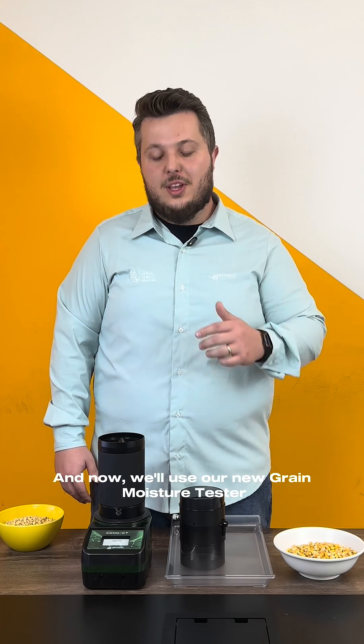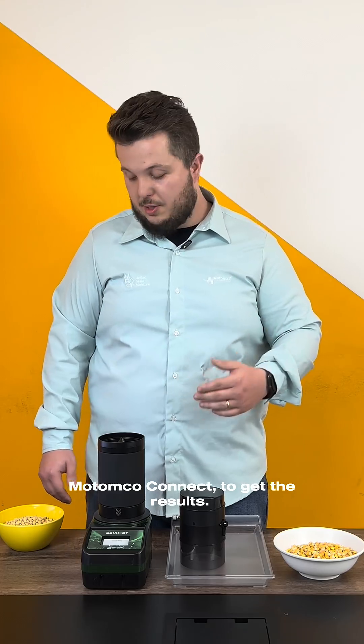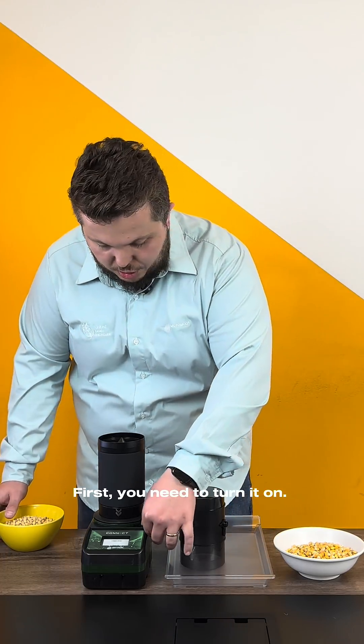Now, we will use our new Grain Moisture Tester, Motomco Connect, to get the results. First, you need to turn it on.